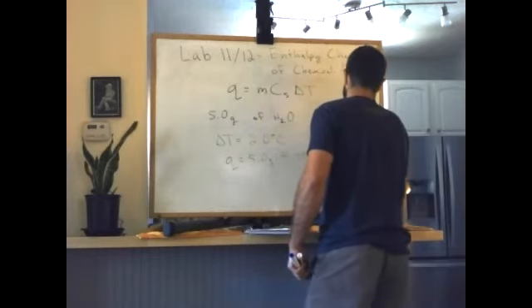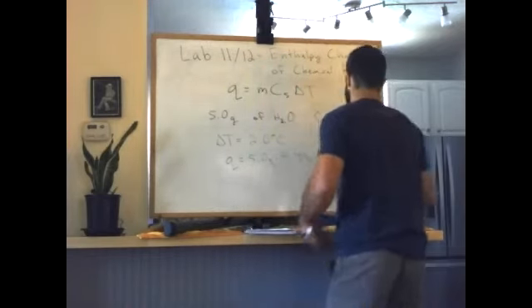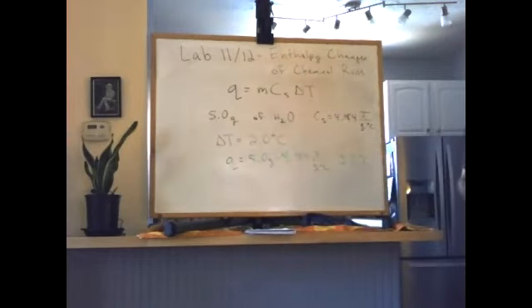And we need the change in temperature of the water. You always need to keep track of your units. Okay, in this lab, we're going to use both specific heats, which are joules per gram per degree Celsius, but we're also going to run into a heat capacity, specifically when we talk about our calorimeter. The heat capacity of our calorimeter is just simply joules per degree Celsius. We don't have a per gram. So a specific heat is per gram, a heat capacity is not.